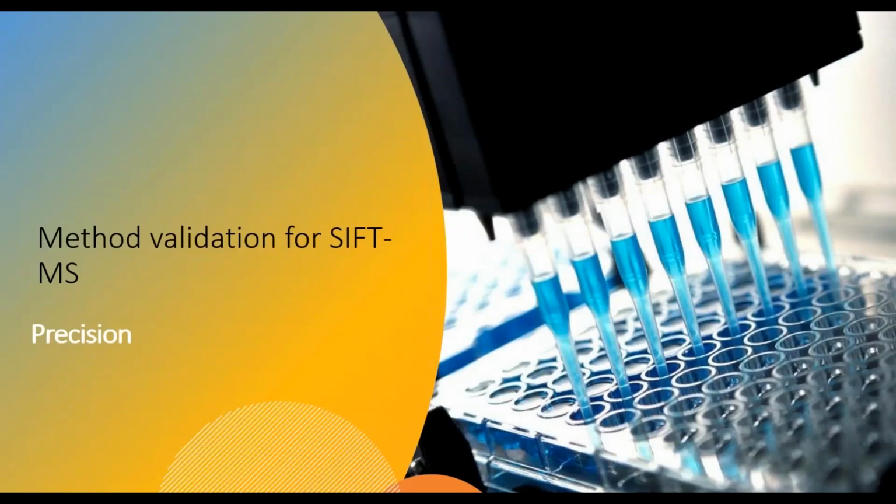So the next part of the validation is to look at precision. So how precise is your instrument? There's no point having a system that can't give you precise measurements. So we needed to check the precision of the instrument. It's a very important thing to check on a method validation.